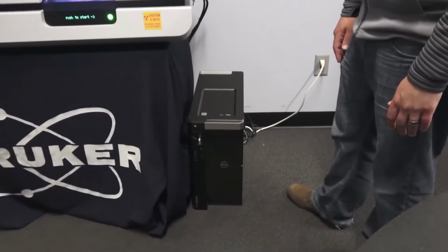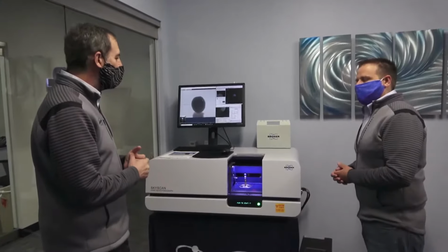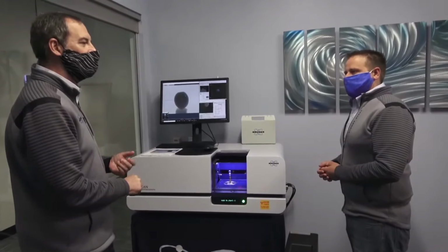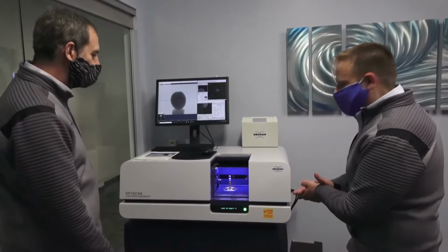And this thing just plugs in and goes. Okay, so do we need any special power? No power, no cooling lines, nothing. Okay. It's just good. So yeah, how do we do it?